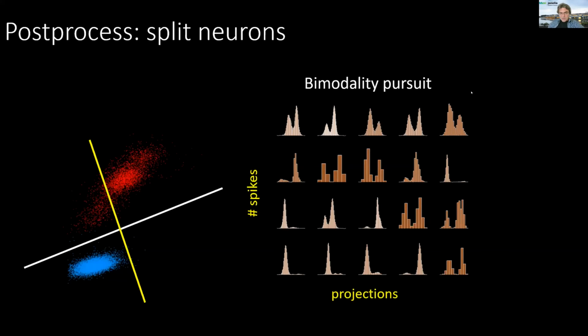Yes, thank you, Matteo. All right, there's another question. Have we compared with Mountain Sort? Well, Mountain Sort has never run on Neuropixels probes, in fact, because it was always a little limited by memory and computational issues.